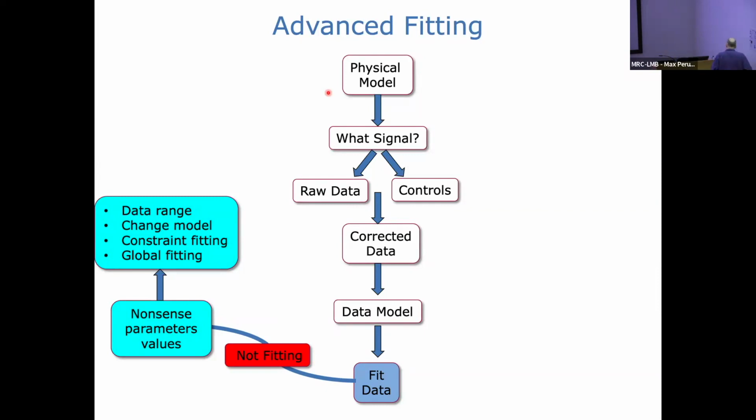Okay, yeah, we often come across this, where one of the components you just can't get up to the concentration because it will aggregate. The thing to do then is either change technique or swap everything around, where you're titrating in the other component, as long as you can get enough of that. This would be a case in, say, ITC, where if you've got something in the syringe, you can't get it up to that concentration, so you can swap things around. Or in Biacore, where one of the components has to be on the surface and the other is flowing across, you can swap that around and have the one that's going to aggregate on the surface.